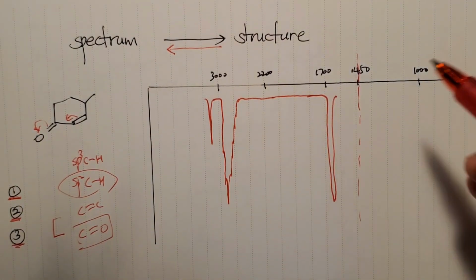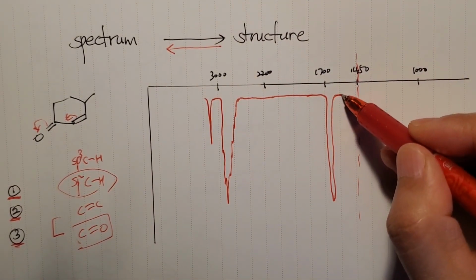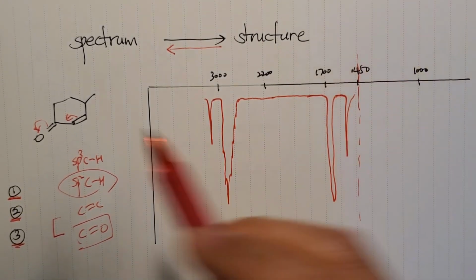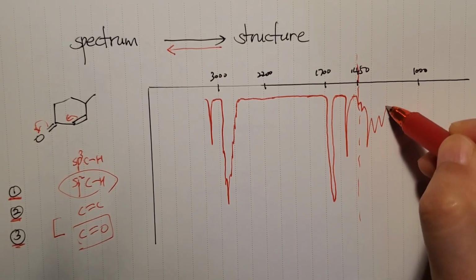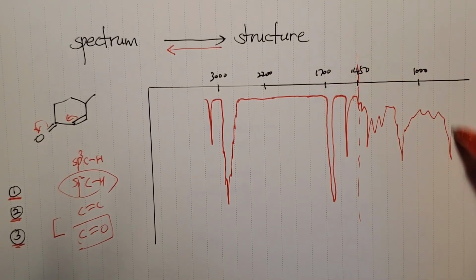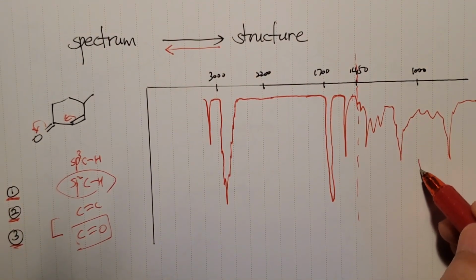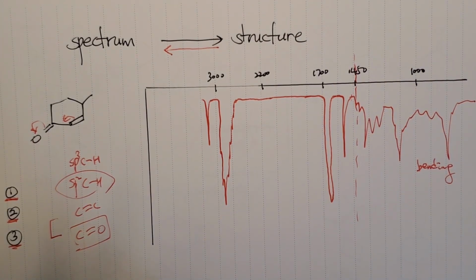Then you have the carbon double bond, so one somewhat intense, right? Because it's getting polarized. Then you can start showing random bending vibration. But you don't have a CO single bond, so it's okay. So this should be enough.